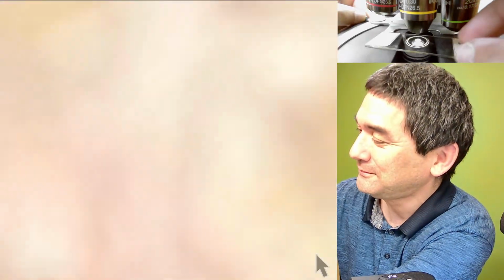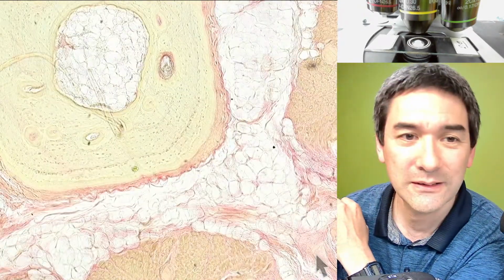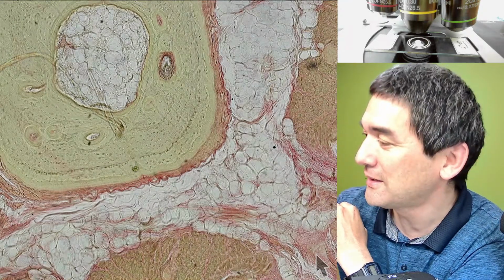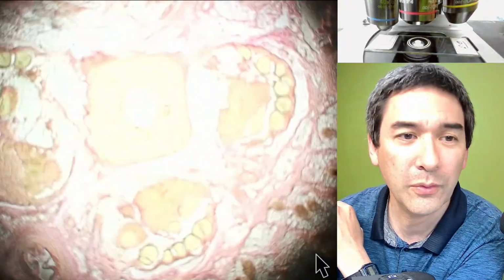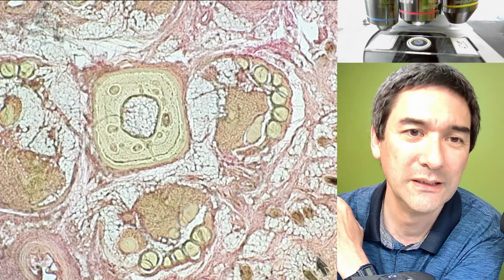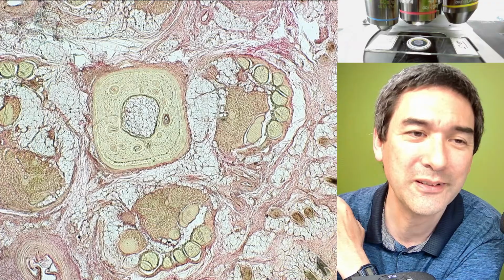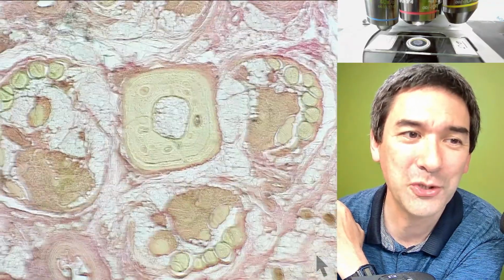Okay. I'm going to go for bright field. I have to go in here. I have to focus. And go down a little bit. Let's see, I give you 4x, just to give you a little bit of an overview. And what you see is so many different types of tissues. For example, I just want to show this to you.